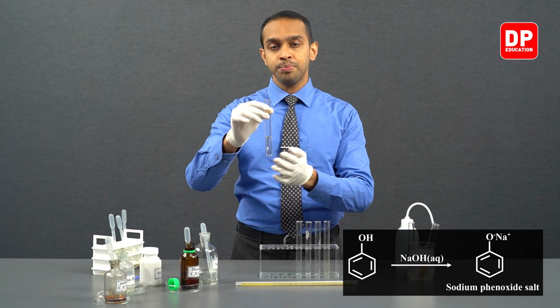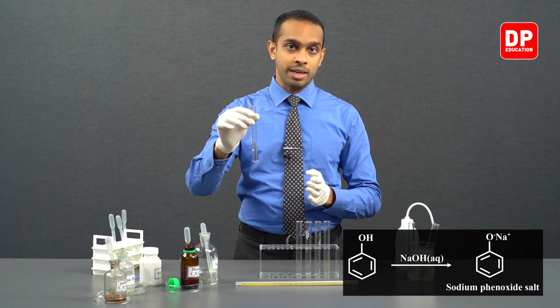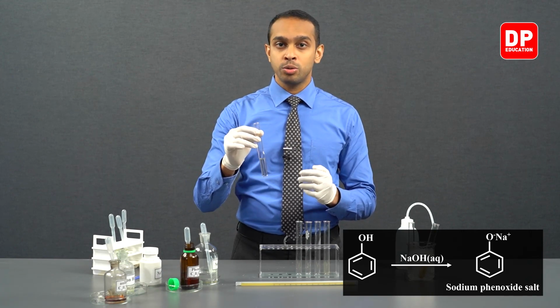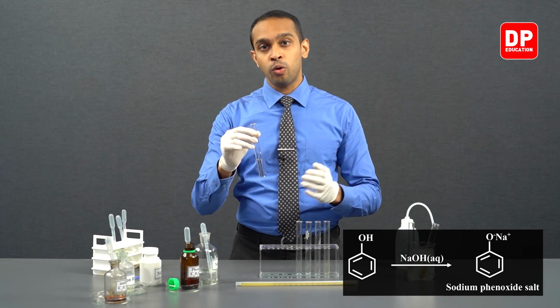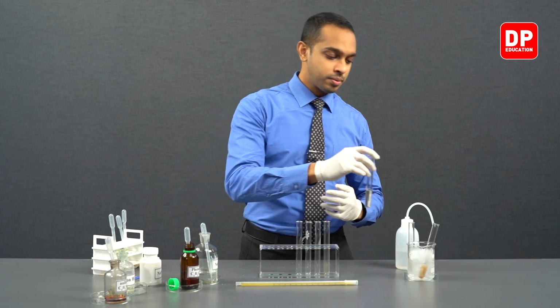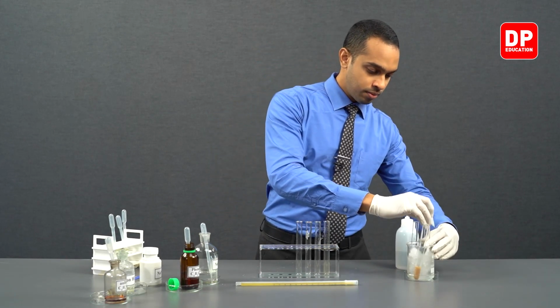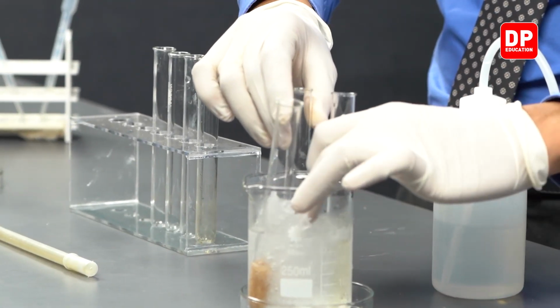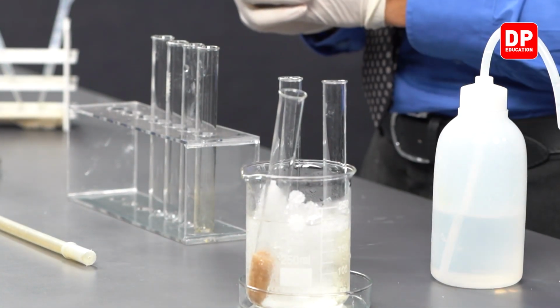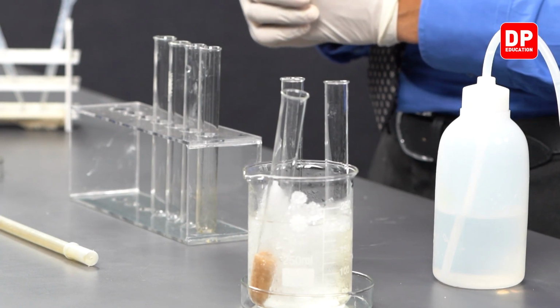So what we have here is sodium phenoxide. Now we will allow that sample also to reach temperatures below 5 degrees Celsius by placing it in a water bath. Now we will allow it to cool down for a while.